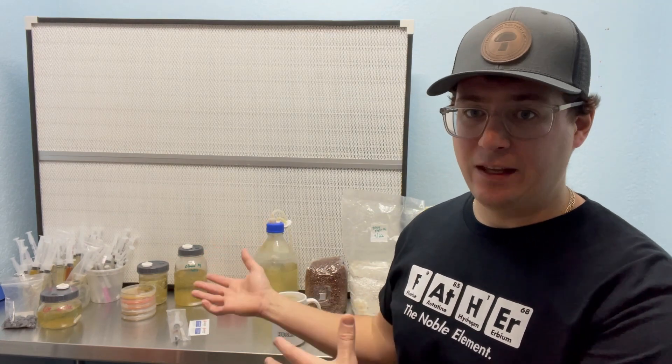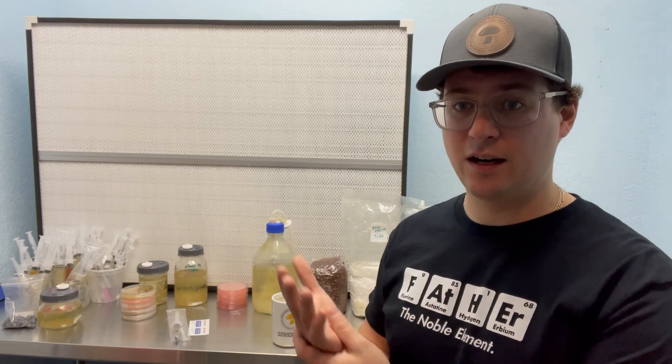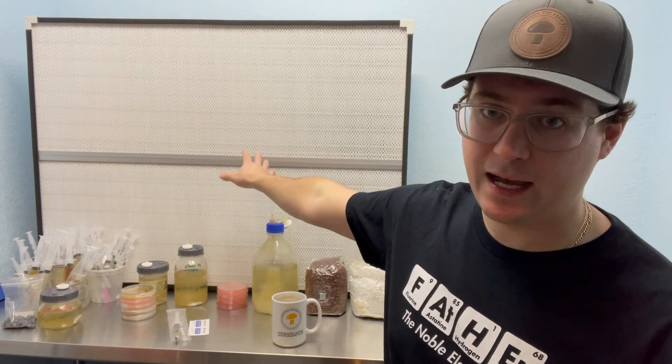What that means is that when you're working in a mushroom lab, you don't want to transfer any living viable cells other than the mushroom that you're trying to grow. Oftentimes, you'll be able to transfer living bacteria from your hand or from your breath, or even from the ambient air. Right now, it's the middle of winter in Colorado. It's the perfect time to practice growing or this is when I do my breeding because there's much less contaminants in the air because it just snowed. All the plants have died back. The ambient spore load in the air is very low. However, in the springtime and the summer and the fall when all of that foliage gets disturbed and the spore loads in the air are higher, you can get more contamination from the ambient air. So that's why I have this flow hood behind me. This pushes clean air through a filter, and it helps to prevent contamination.